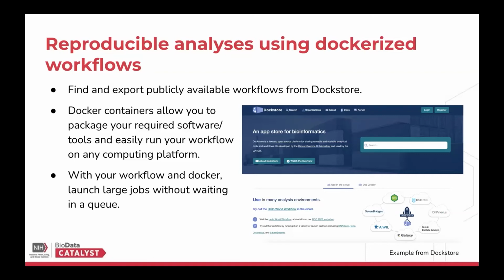You need to write your workflow in a language that the analysis platform can understand. You can use the workflow description language, or WDL, as I'll refer to it in the rest of this presentation, or the common workflow language, also known as CWL. So I'll refer to it as CWL.